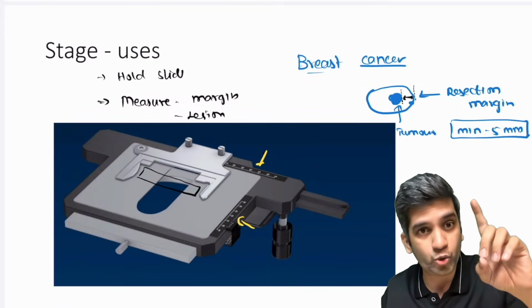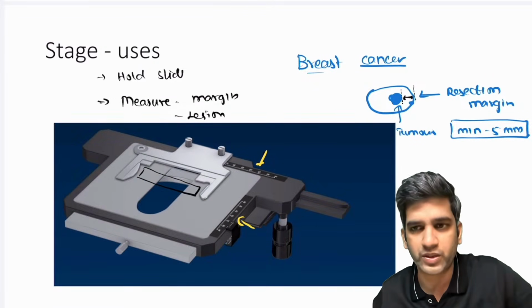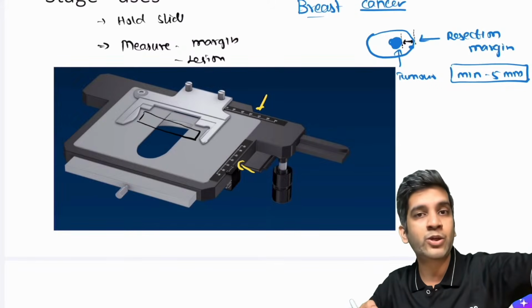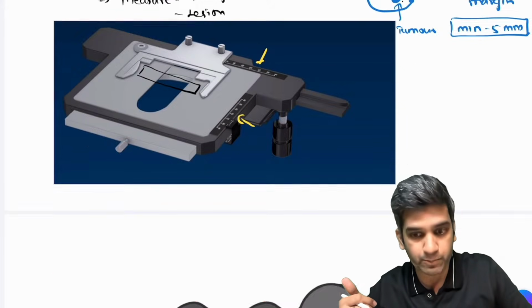Next time I want you to go to the lab, look at the markings, maybe keep a slide and try to measure it just once, fine, perfect. Akib, I will not use the length of the specimen. That will be gross. I'm looking at the microscope. I cannot have the entire specimen in the microscopy. Maybe the length of the lesion. That will be an appropriate one, right?